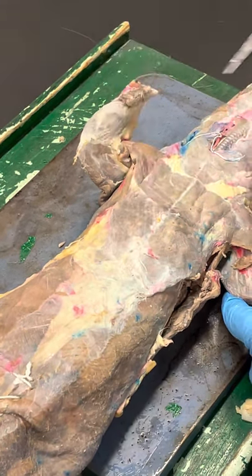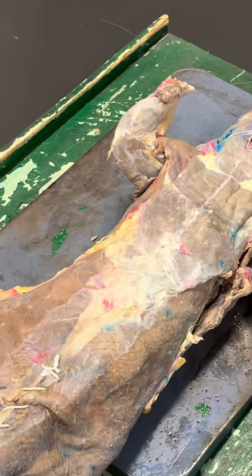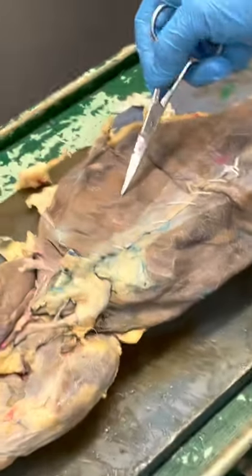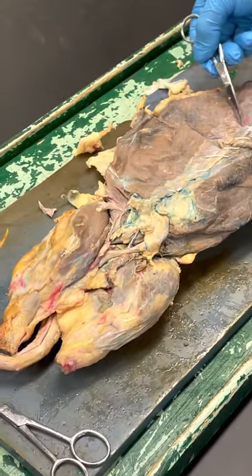They have a biceps brachii, but it's super small because it's not something they use, so I won't bother with that. Then this is your external oblique, and this is their rectus abdominis, just like ours.